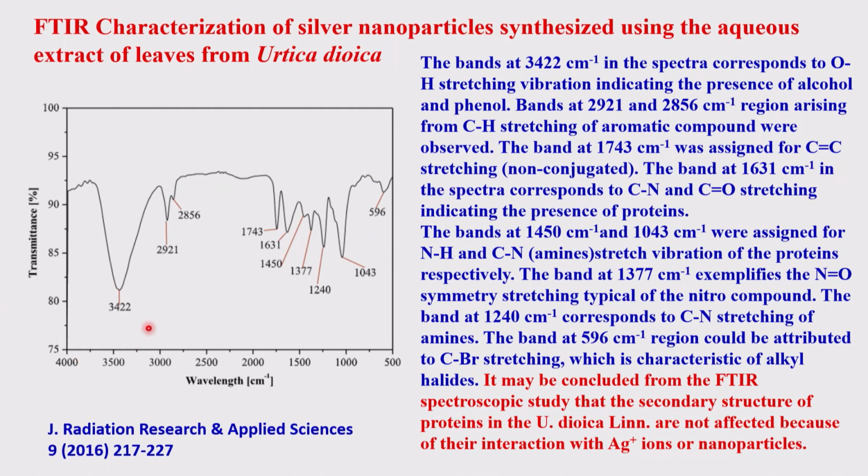Clearly you have the region of the OH-NH kind of region, and clearly the region of CH, and then you have the region of some kind of double bond, carbon-carbon double bond systems, etc. Then you have the carbonyls and a few amide based bands, and you know that the protein has the amide group.